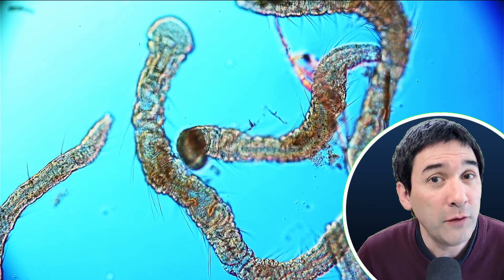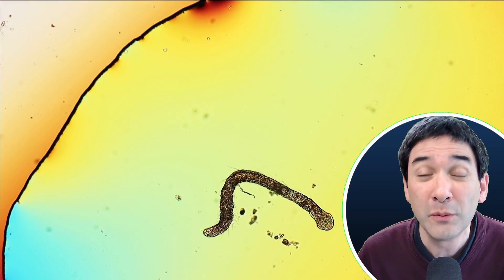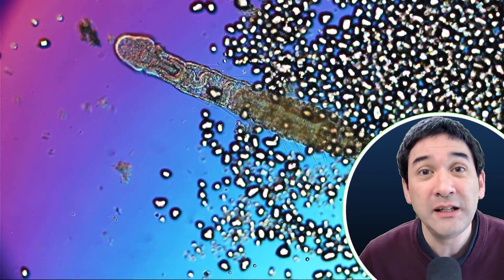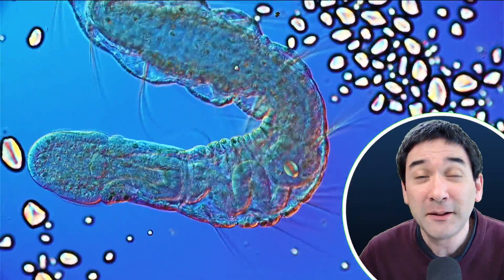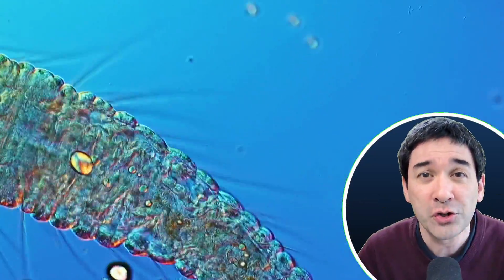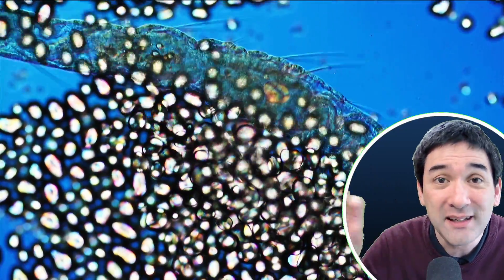I added a little bit of potato starch — all I did was scratch the surface of the potato. These starch grains are a food source for those little worms; they're just small enough to be eaten by the worm. However, some of the starch grains were still a little bit too large. After I did that, the worms really gulped them up, and after a minute or so I could see that there were already starch grains inside the body of the worm, inside the digestive system, traveling down from the mouth backwards. Some of those starch grains were actually pretty large — I surprised myself a little bit how the worm was able to gulp up such a large starch grain — and yes, this one actually even got stuck a little bit.